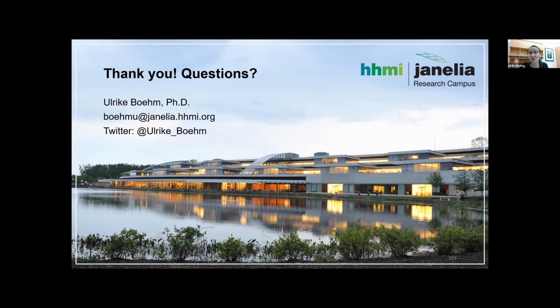Because it's quite complicated, and our scientists here, in particular the team around Harald Hess, have optimized this so well that they have a very good handle on their systems. Every time a new sample comes in, they can with very high confidence scan it and get good results out. Just complicated, but can be done.